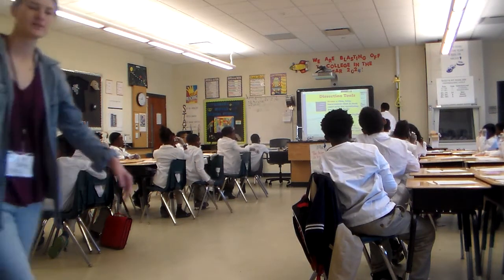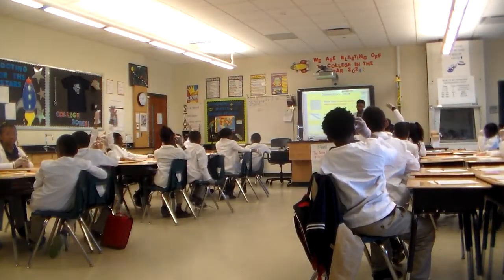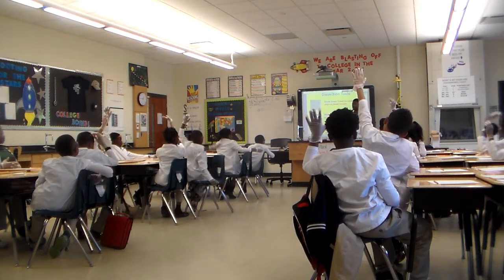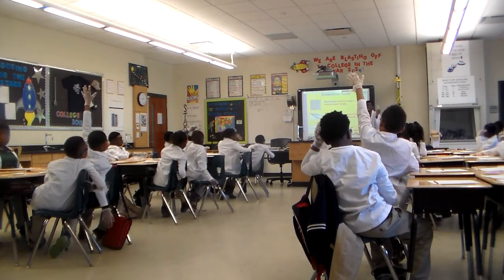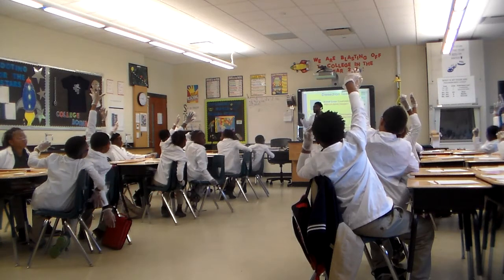So, take a look at the next set of dissection tools. We're familiar with these, right? Pretty familiar with them. Tajale, could you tell me what the next one is, please? Hand lens, right? What's the purpose of a hand lens? Raise your hand. What's the purpose of a hand lens? Help me out, Adam.